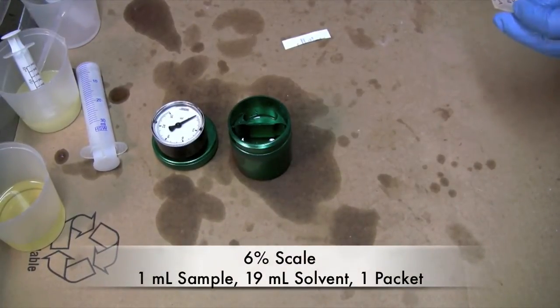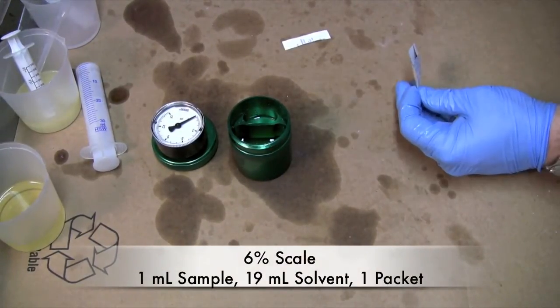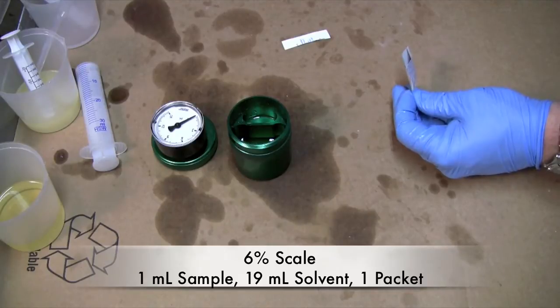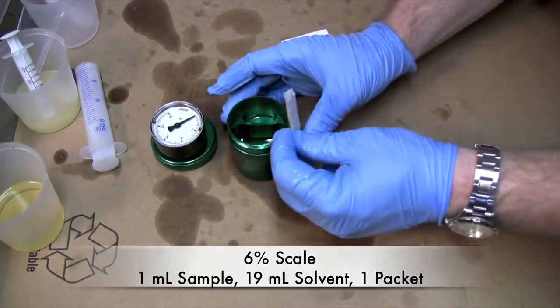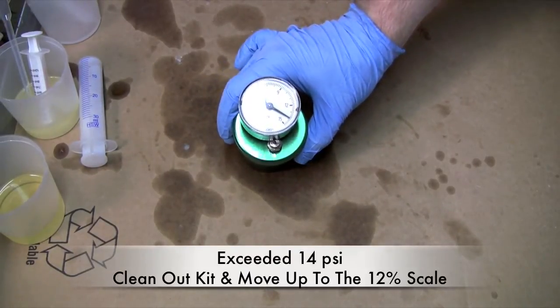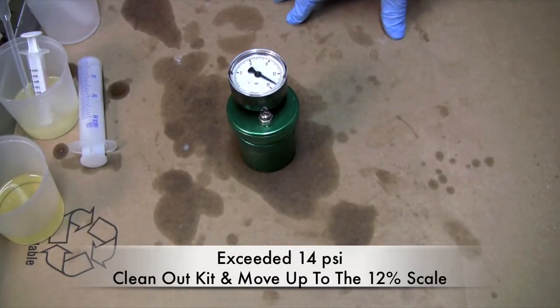We've now moved up to the 6% scale. It is set by adding 1 milliliter of sample and 19 milliliters of Reagent B, and then your packet of Reagent A. As you can see we've just hit 14, so we're now moving into the 12% scale. This oil has an awful lot of water content to it.